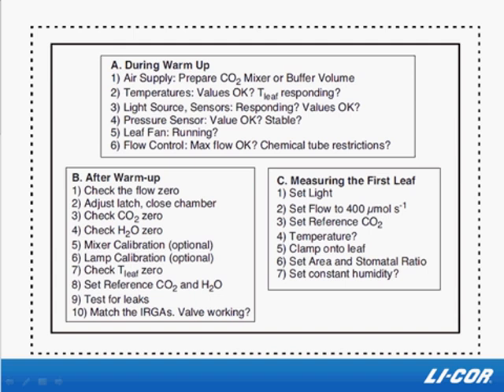One thing I want to mention is that whether you do a response curve or a survey measurement, you want to make sure that you go through the checklist in Chapter 4 before any measurement. The checklist in Chapter 4 provides us a general hardware and software overview. If you go through it each day, you can have confidence that your measurements are not being influenced by any problems with hardware. If you don't go through the checklist, you might discover you had a problem when it's too late to fix it. And no one likes discovering that they can't use data.